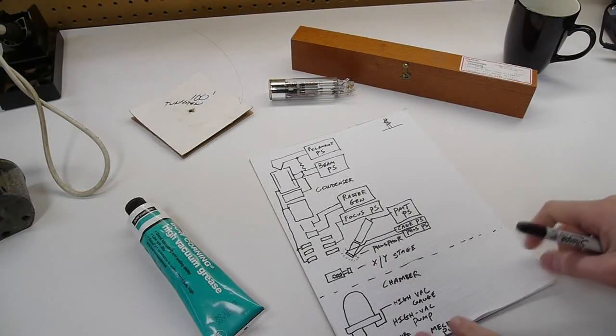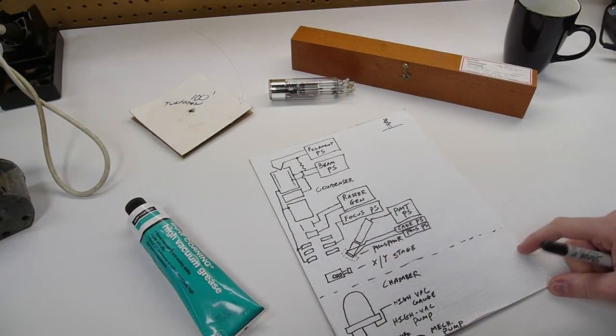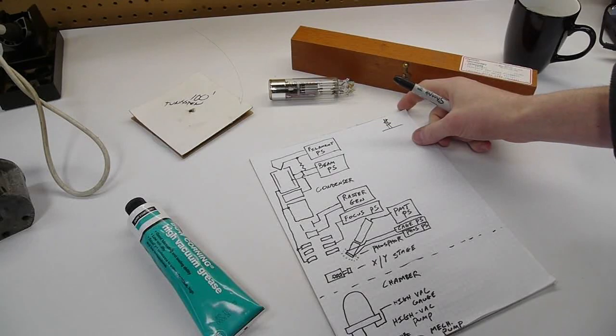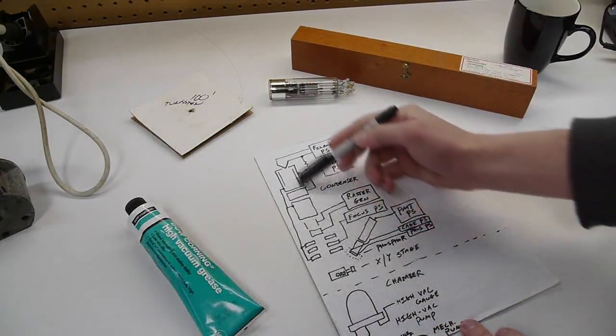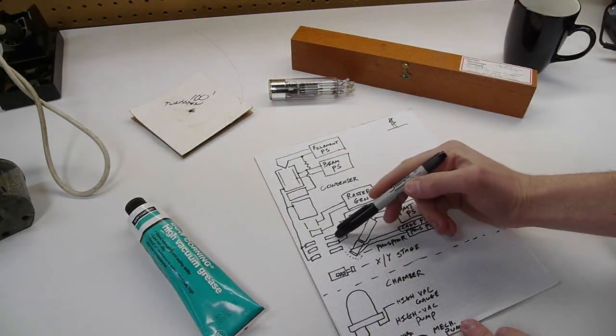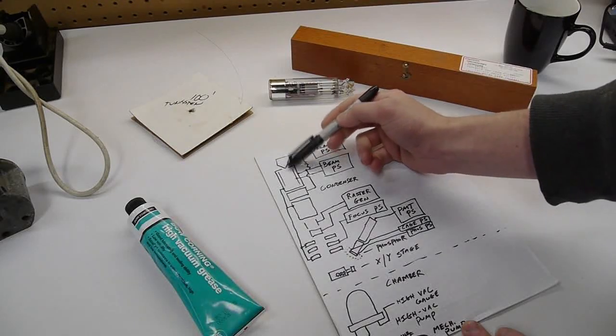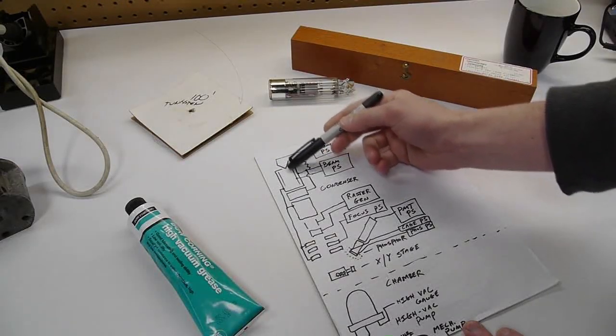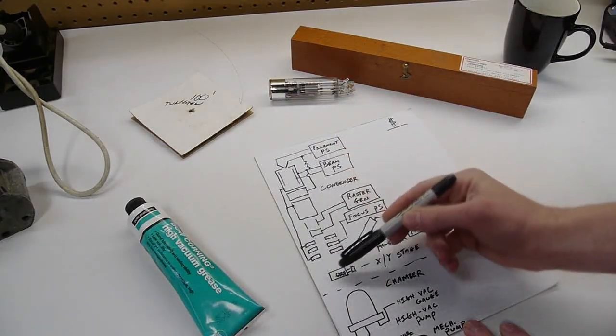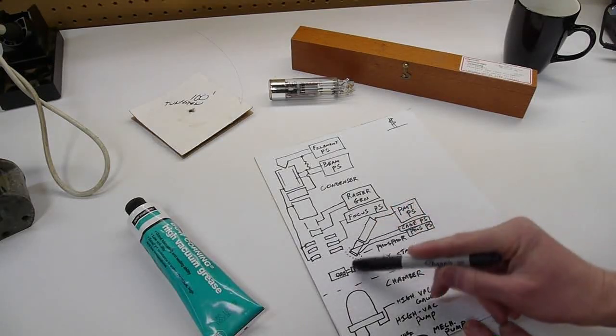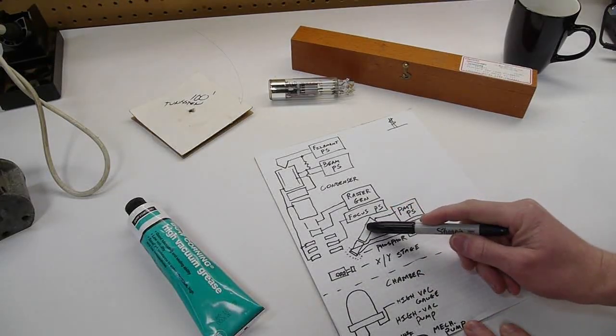So here's a really rough schematic of the microscope. Sorry for my poor drawing ability, but this is basically the electron column. So this is the filament at the top, the electron gun, the electrons proceed down the column, this is where your sample would be, and this is the secondary detector.